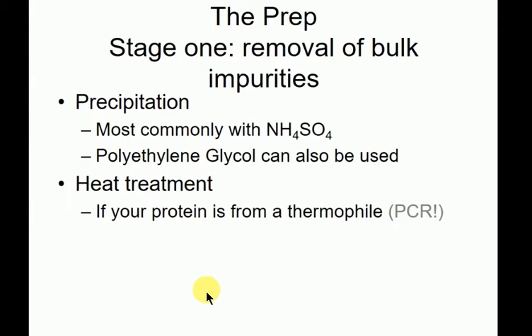And if you do this, you can even use the PCR machine. I used to do this quite a lot. You clone the thermophilic protein out. You set the PCR machine to ramp the temperatures up. You can have tube 1 ramp up to 81, tube 2, 83, 2 degree steps, and you can work out the precise temperature at which your protein stays in solution, but everything else from your expression strain pellets. So it's quite nice to be able to use a PCR machine to purify proteins.